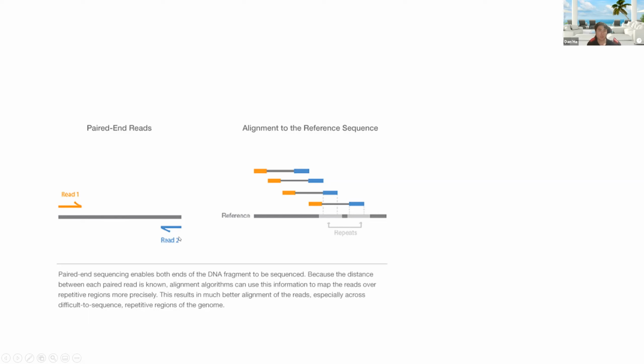So if your read length is, let's say, 150 base pairs, when you combine them with paired end, you can get a sequence length of up to 250 or 300, which can cover some of the repeat regions in your genomes. Theoretically, it can improve your assembly results.